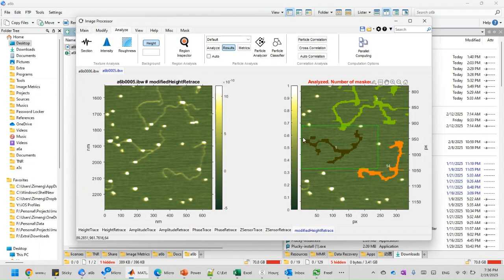That basically means I have already analyzed this particle, right? I finished that, and the program gives you a label with this crop. So in the future, you know we have already gone through this particle, and we're done with this particle. Basically, then we can move on to the next particle. And you get the idea.